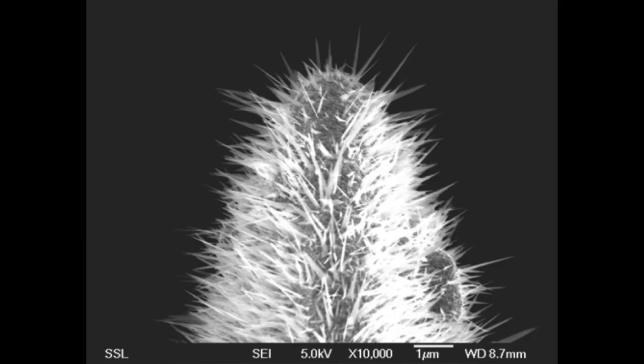Using this picture, the base to peak length of the object can be deduced from the scale shown at the bottom. In this case, 1 micrometer is equal to 0.6 cm, and the length is 4.8 cm. Therefore, the image has a length of 8 micrometers. It is also worthy to note that the magnification in the image is inaccurate, as 8 micrometers multiplied by 10,000 equals 8 cm. However, the image on the screen has been shrunk and hence is inaccurate.